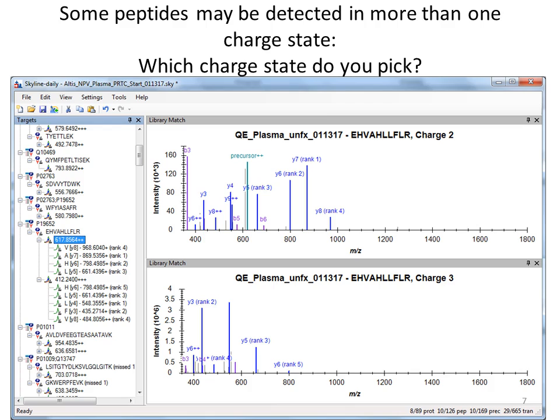And then here, what you see in these spectral libraries: first, when you click on a peptide, it'll show you the spectral library that's present with the particular precursor that you're on. So with this one, it's a 2+, which is that one. And this is a manufactured screenshot, so I added in the +3.